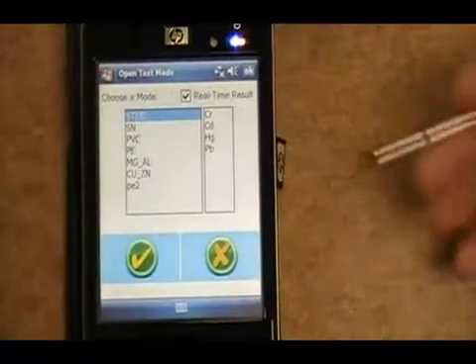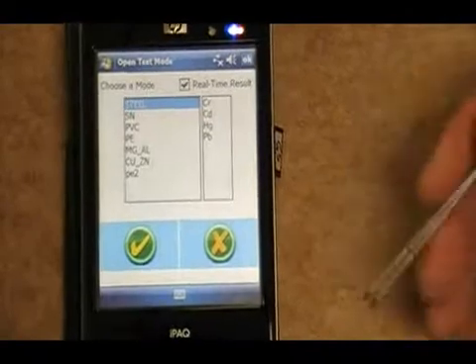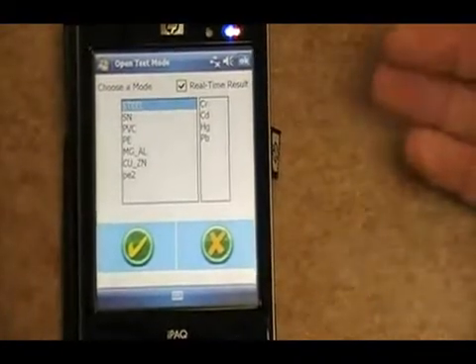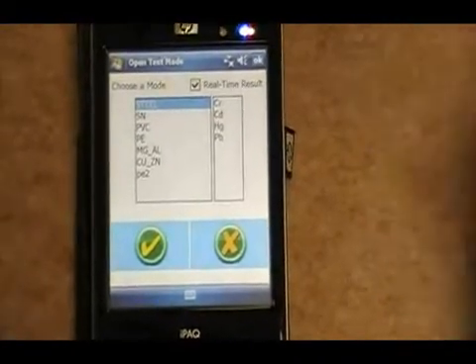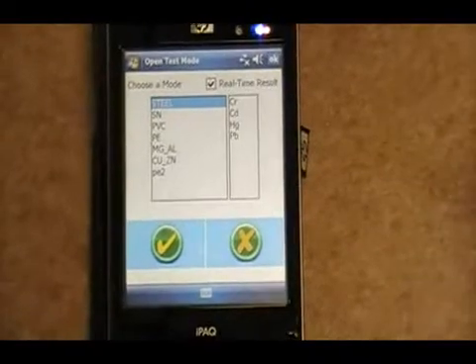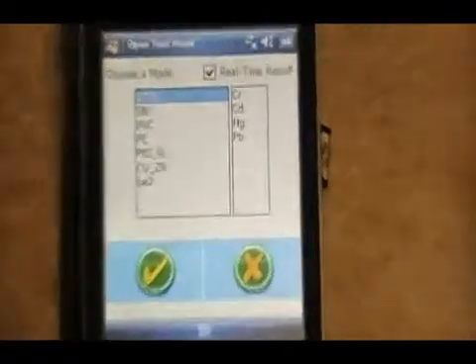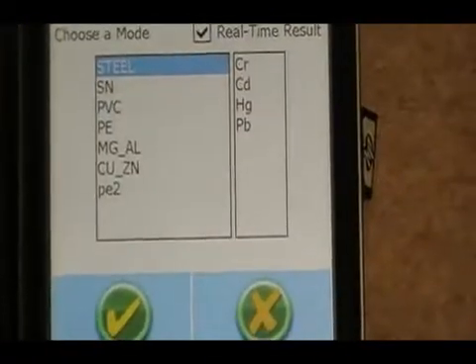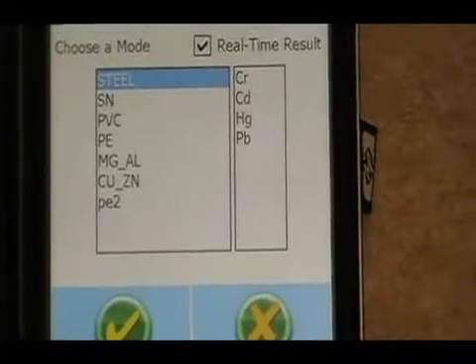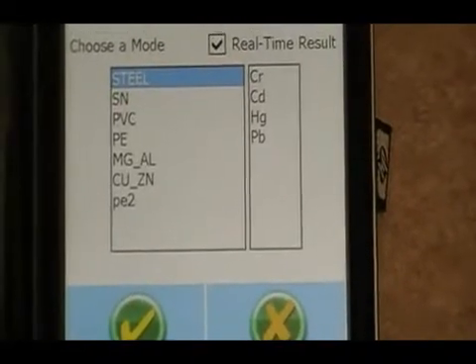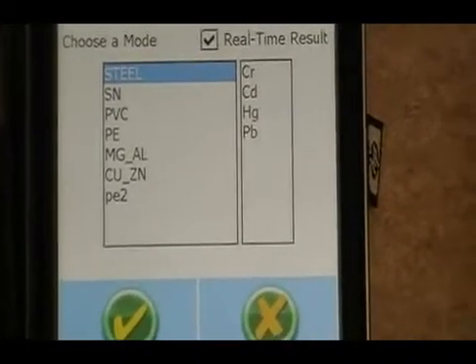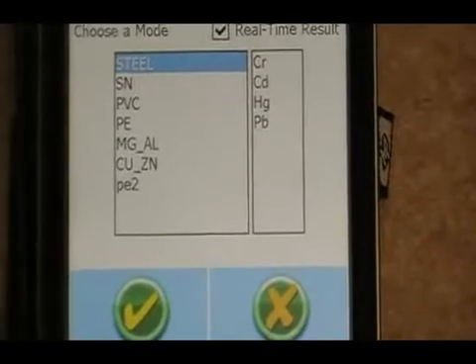It then gives you the selection of the different programs you can run for that specific analysis. We have steel, tin, PVC, polyethylene, magnesium, aluminum, and a copper zinc or brass compilation.